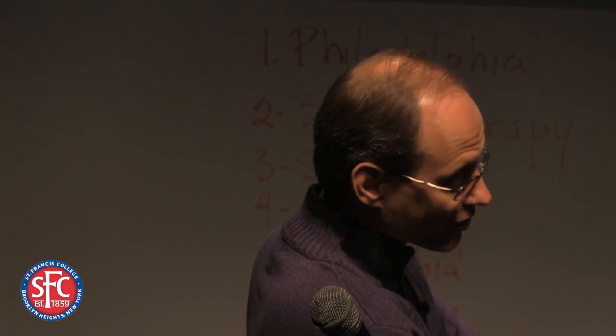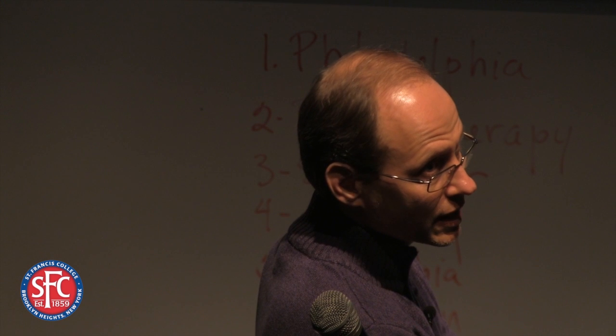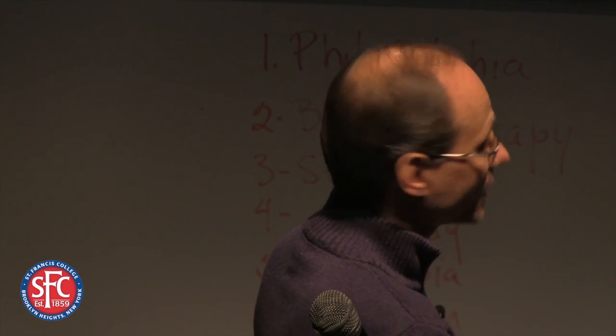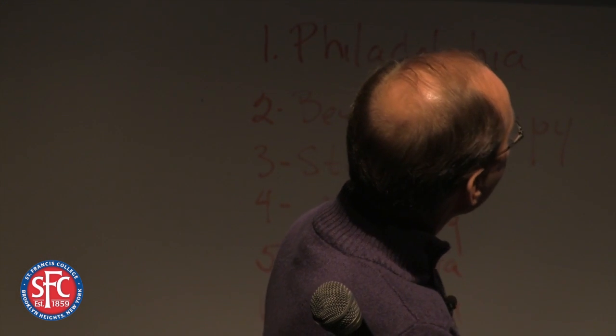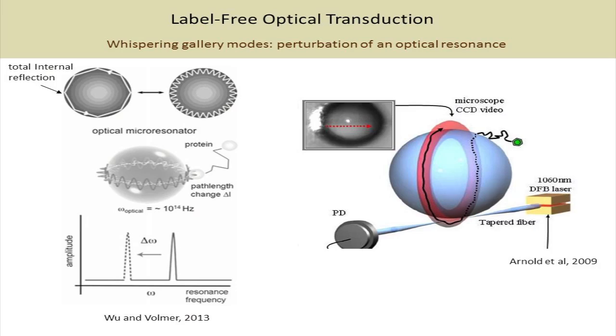And there's going to be a certain frequency at which this back and forth motion is optimally energized, and that's called the resonance frequency. And that resonance frequency is very sensitive to the mass of the crystal and anything that's on top of the crystal and attached to it, including any biomolecules. So it's a mass-based technique at the simplest level of description, where if binding takes place on top of this crystal, it's going to change the resonance frequency.